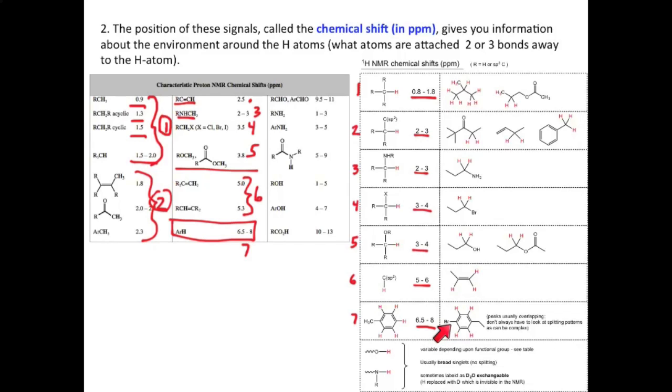Here we're looking at parabromoethylbenzene. There's 4 hydrogens here connected to this benzene ring. One note, the peaks in this range are usually overlapping. In a few slides we're going to be talking about splitting patterns. This can be very complex, so often we don't look at splitting when it comes to benzene rings. We can, but at a basic level you don't always have to.